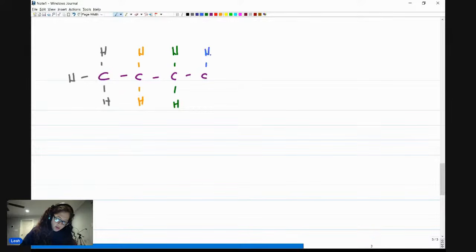And here I have another CH3. For each carbon, I find it helpful when you look at the hydrogens as their own thing. That's why I put them in different colors. But let's take a look. Let's first validate the fact that this is an sp3 carbon atom. All the hydrogens on it are going to be equivalent.